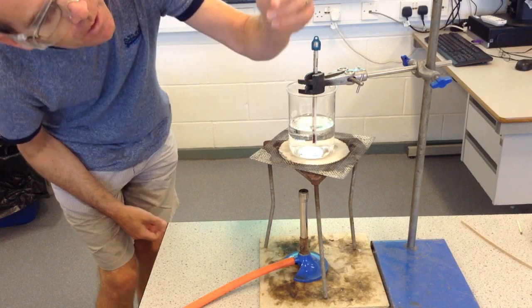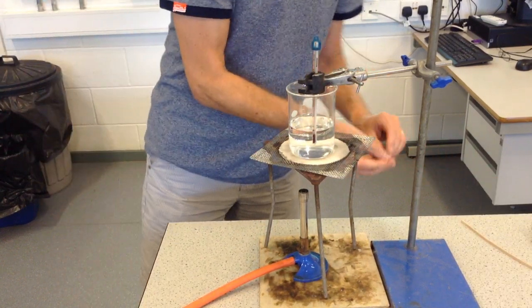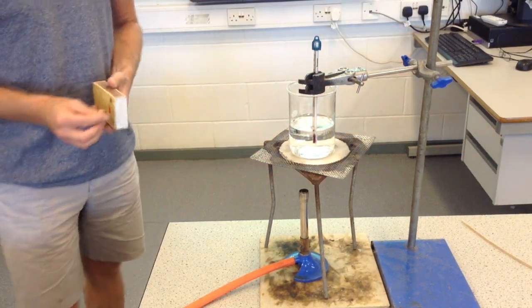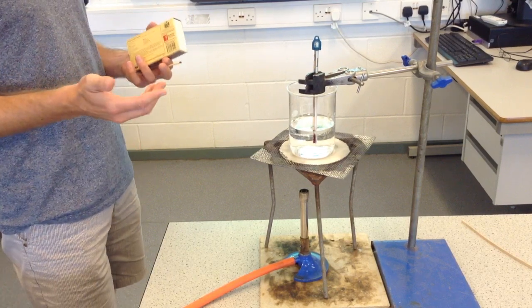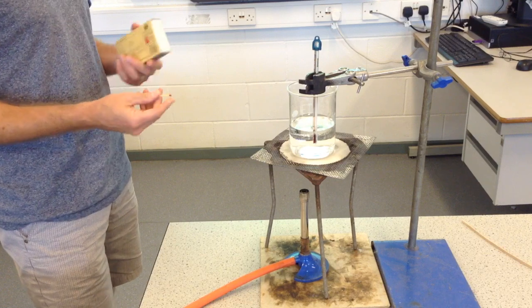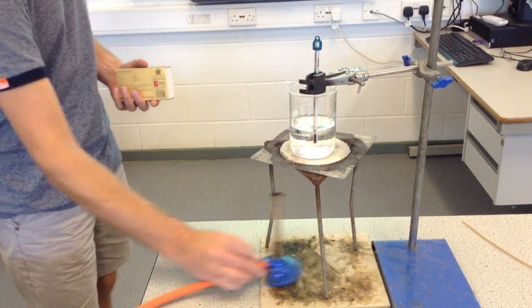I can see the numbers on the thermometer. I'm going to use a stop clock, and when I start the Bunsen going I will start the timer and record. Every minute I'm going to write down what the temperature says. First of all, let's light the Bunsen.